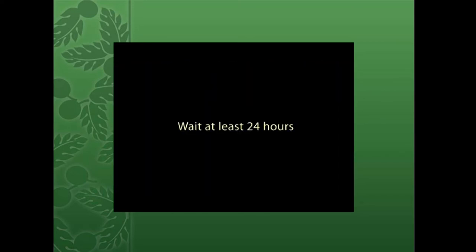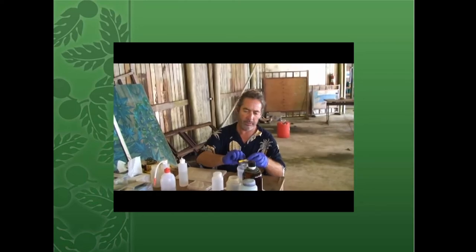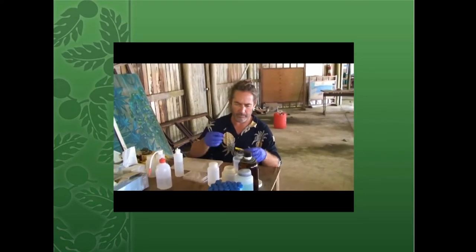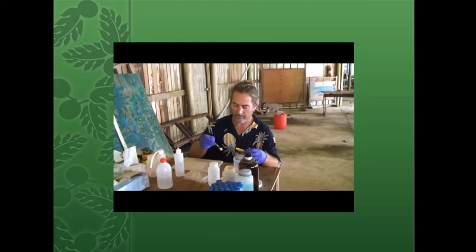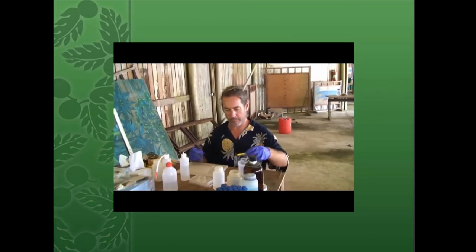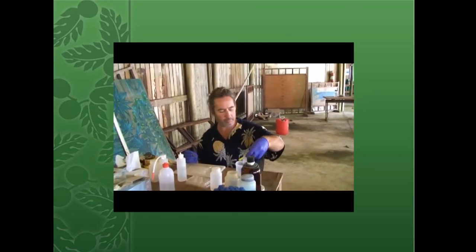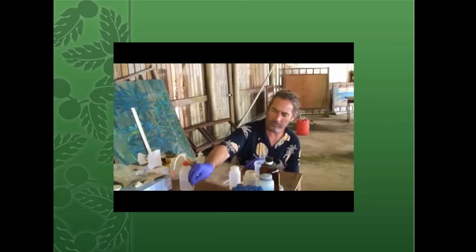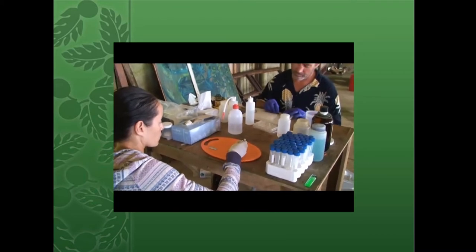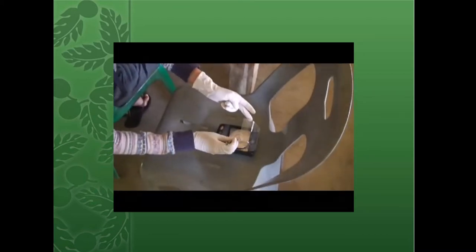Wait at least 24 hours for that fixative to work, and remove the gonads and the tag from the bag. Weigh the whole gonad. Record that weight. Next, you'll take subsamples from gonads that you judge to be mature ovaries.